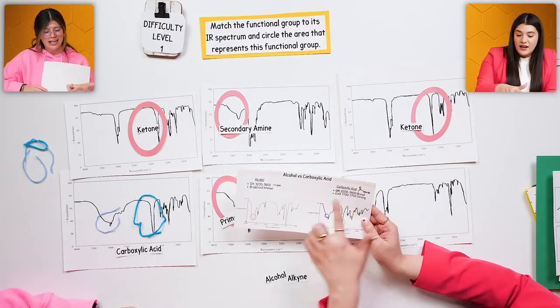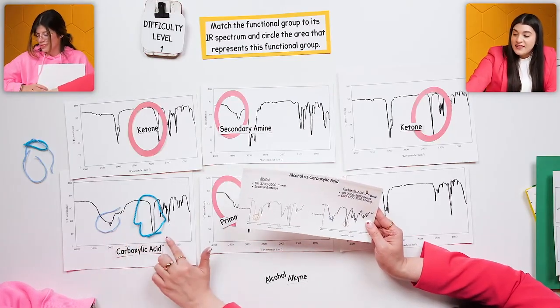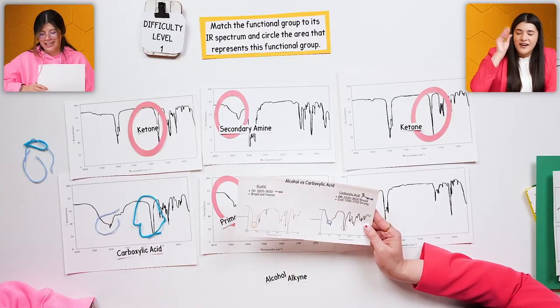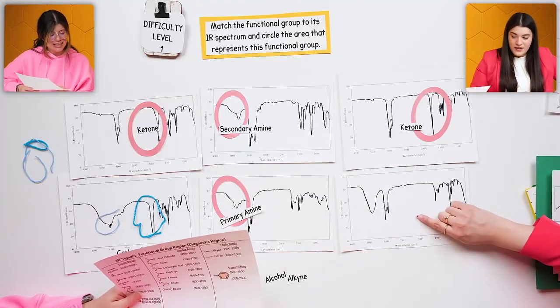You're really just looking at, I know this is just telling me the oxygen connected to the hydrogen. That's here. This is that carbonyl group, carbon double bonded to oxygen, and that's here. And then you piece them together and you know, okay, carboxylic acid. That makes so much more sense. I like that. What about this last one?